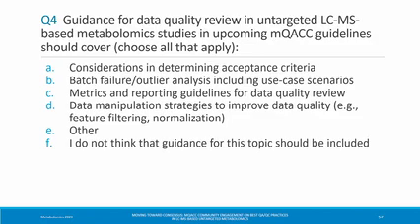I guess one of the things that we learned was when a reference material is useful and when it's not useful. So for some of our human studies, we could get initially a large amount of reference material from horse plasma, and we were running that alongside our samples. And then what you found with your PCA analysis was that horses are really different to humans. You know, they were well away from actually any of our human samples. So actually, in terms of batch correction, they weren't a great sample set to be running alongside there.